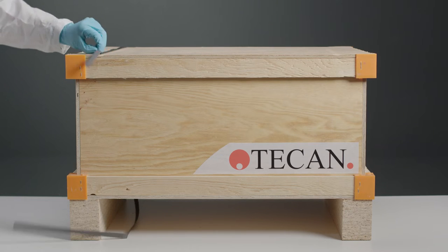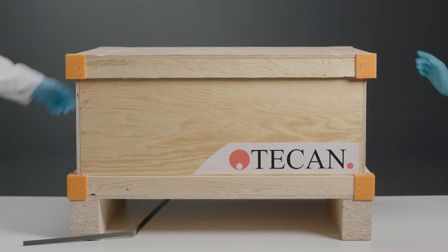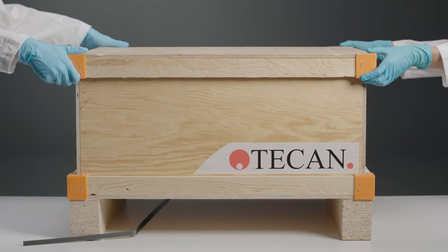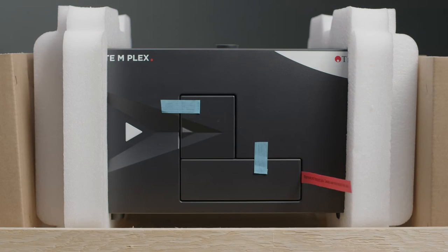The Infinity 200 Pro comes in a crate like this one. Be sure to check for any damages upon arrival. Carefully remove the device.